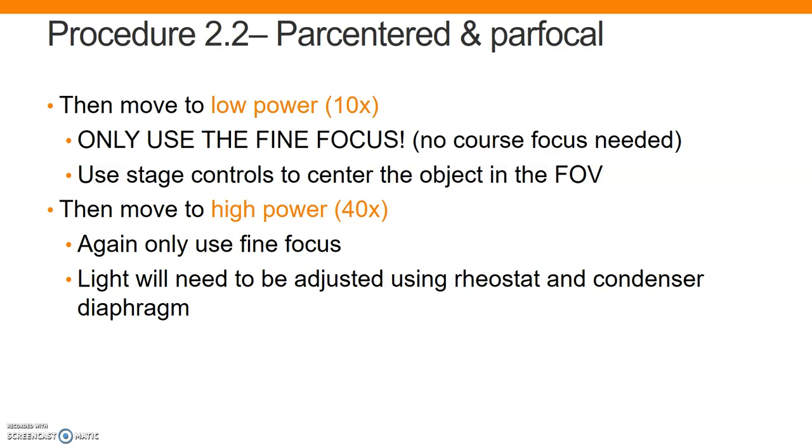So that will give you a clearer picture of whatever you're looking at, but you are losing some things as you zoom in as well. You lose the big picture and you lose light, which is why we have the adjustments the way we do on our light levels.